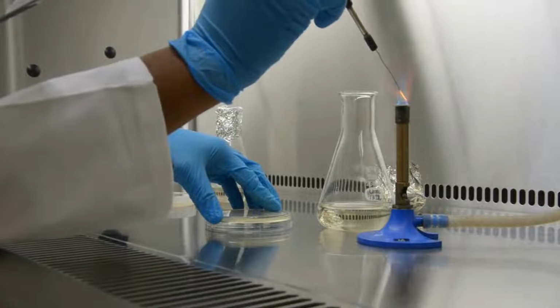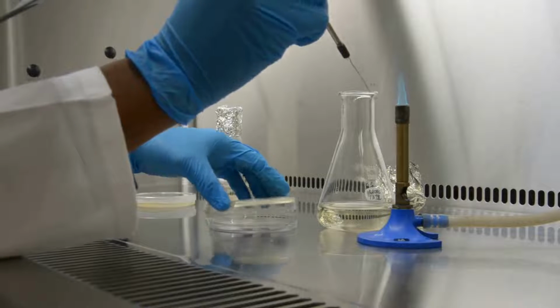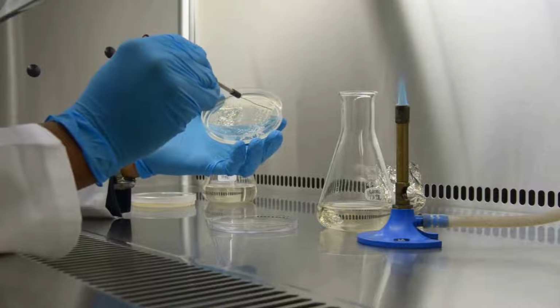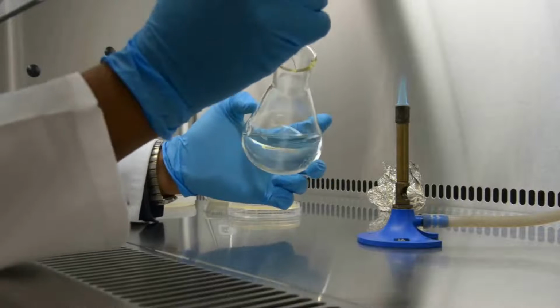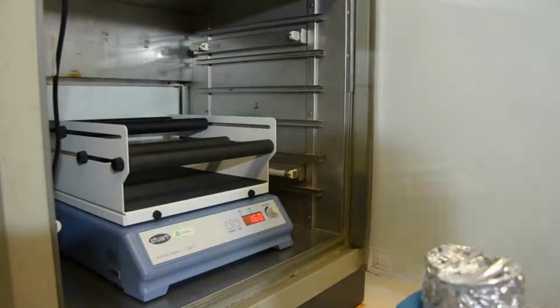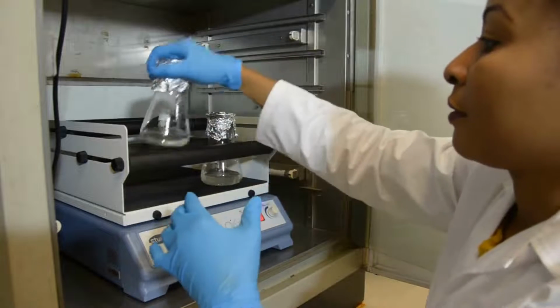Scrape off a loopful of cells from the 48-hour-old plate and inoculate them into a 250 milliliter conical flask containing 100 milliliters of YNB broth that is supplemented with 4% glucose. Incubate the flask at 30 degrees Celsius for 24 hours on a rotary shaker.